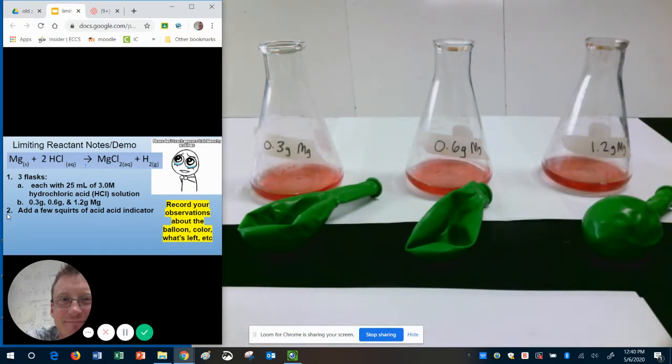Now, think about this. As this reaction happens, the magnesium powder that we're going to add is going to react with the HCl. And when we're done, we don't have HCl on our product side. However, that's only true if we have enough Mg to react with all the HCl. So what we need to be looking at is what color will this liquid be in these containers if there is any acid left over, any of the HCl.